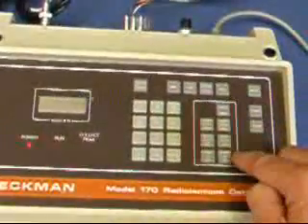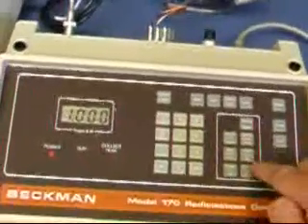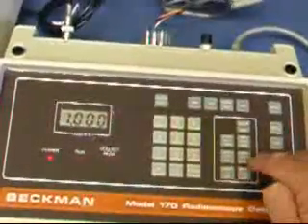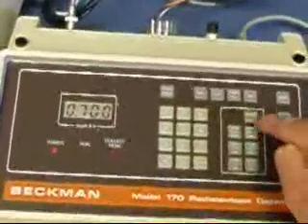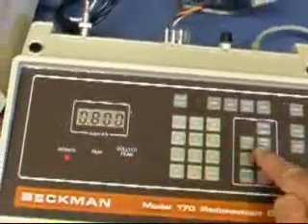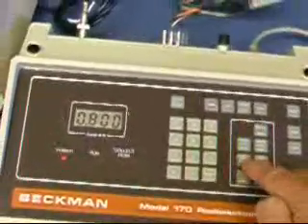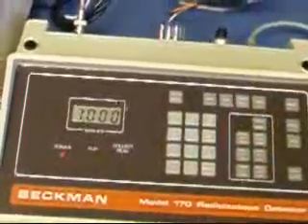Here are the settings: the fraction collection time, the exit length, background, scale, tubing ID, cell length, flow rate, and reset.